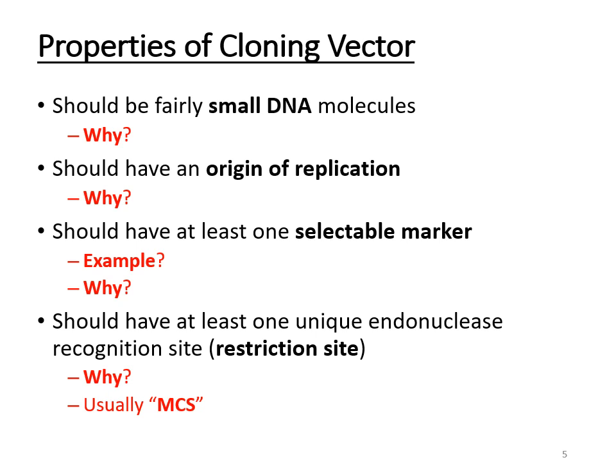It should also have at least one selectable marker. We're going to go through the selectable markers we have in our experiment, but an example of a selectable marker might be antibiotic resistance, or genes for color changes, or even fluorescence. We're going to go through the specific names like beta-lactamase and beta-galactosidase later, but examples would be genes that code for color changes, fluorescence, or antibiotic resistance.